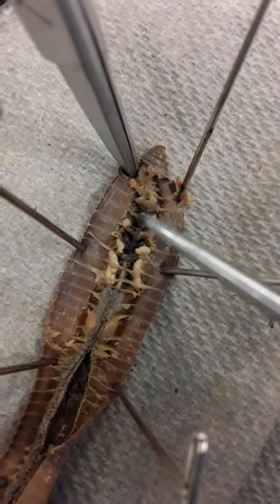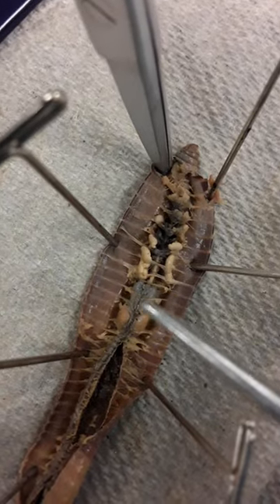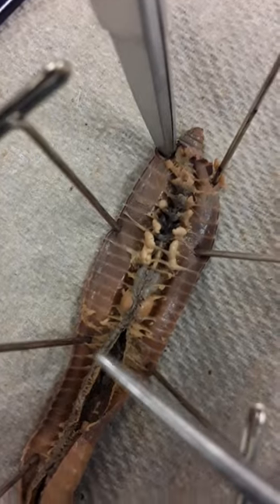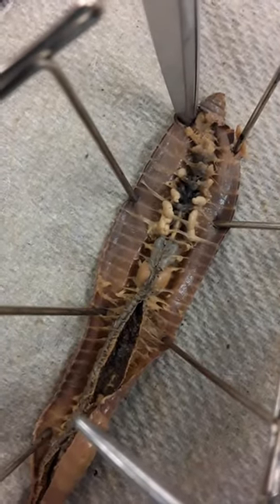The pseudo-hearts are kind of the dark bands that you see running across, and the esophagus would be underneath that. The crop is this dark set of nodes right here, and right below would be the gizzard. The dorsal blood vessel is this one right here — it kind of runs along the whole dorsum of the worm.